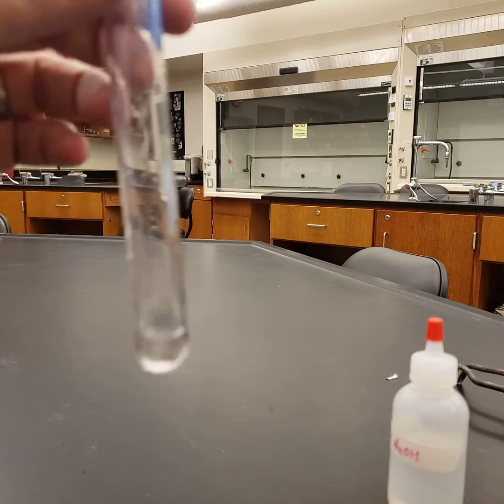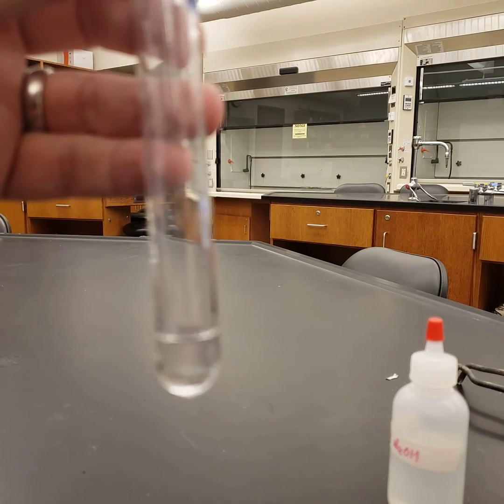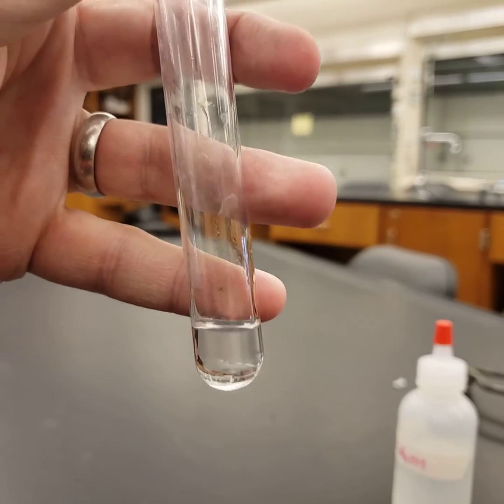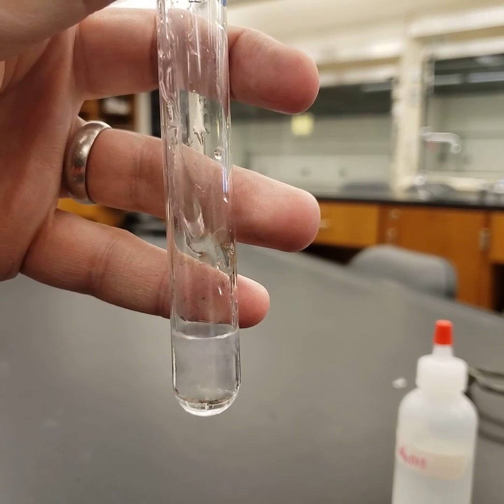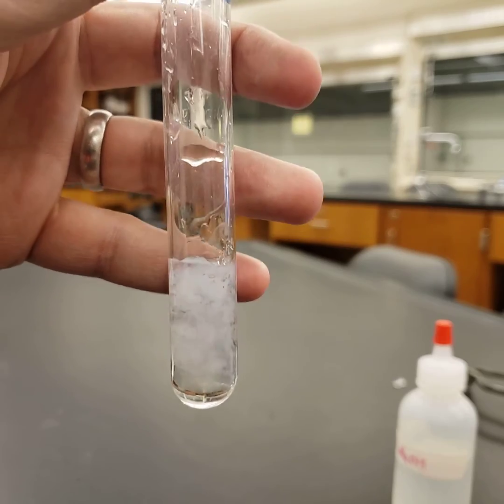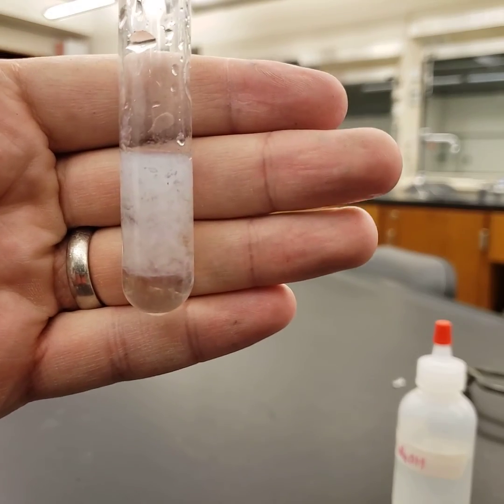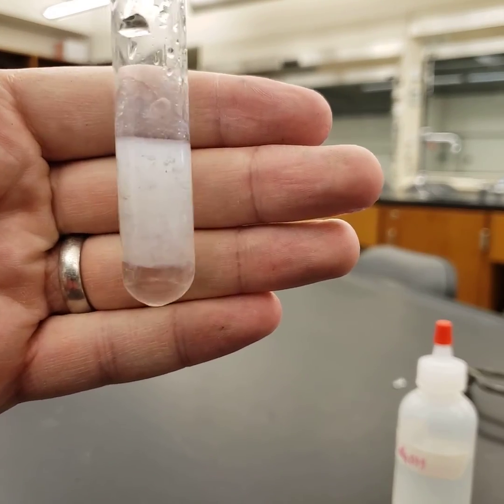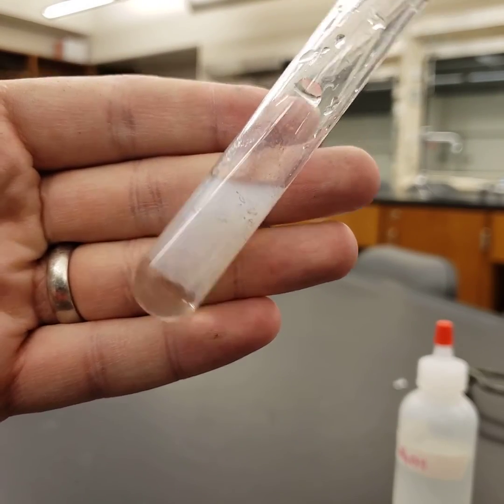Now we're going to add a small quantity of the other clear colored liquid. Note as the two liquids merge, something is happening. We look in there and see something being produced.